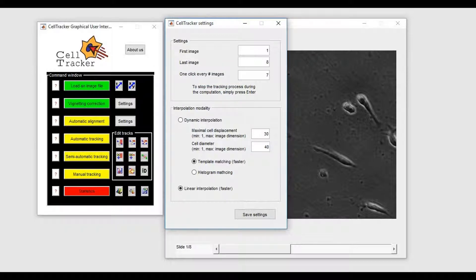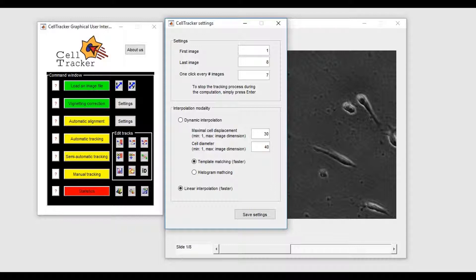If linear interpolation is selected, the cell coordinates are computed by simplifying a line between the points defined by the user.